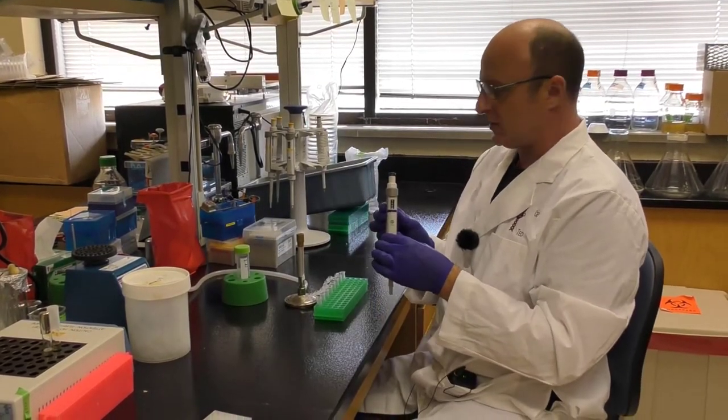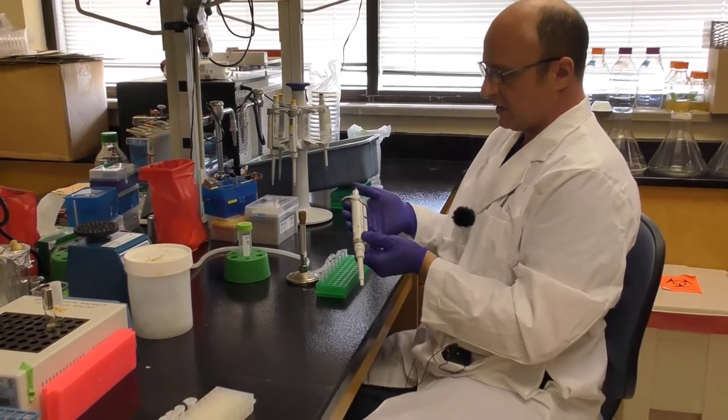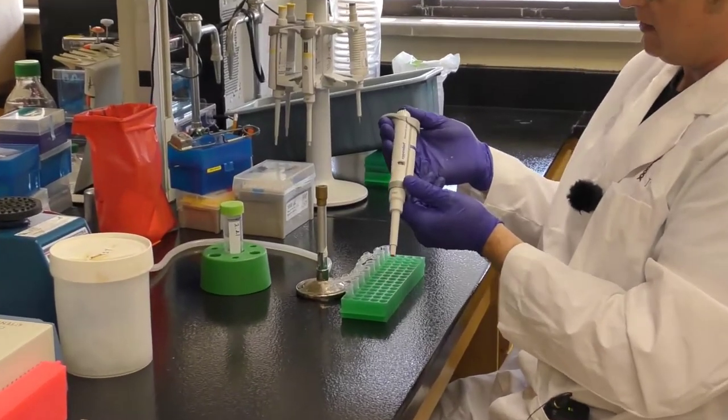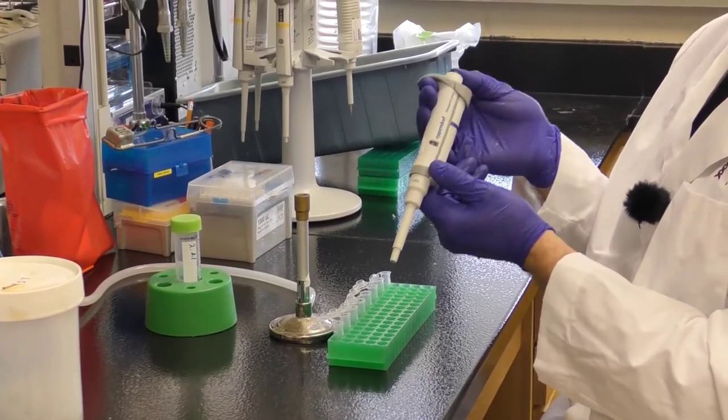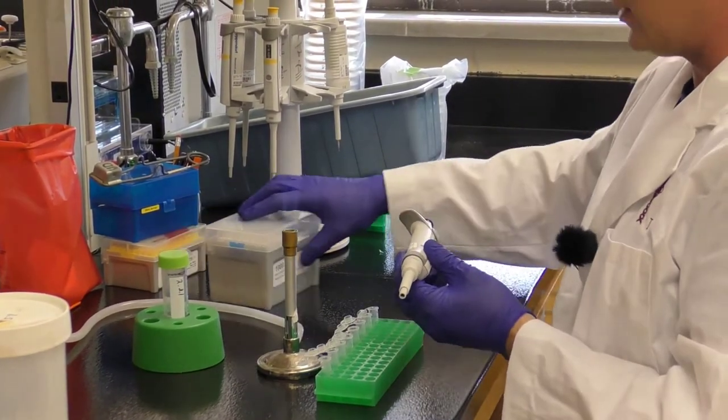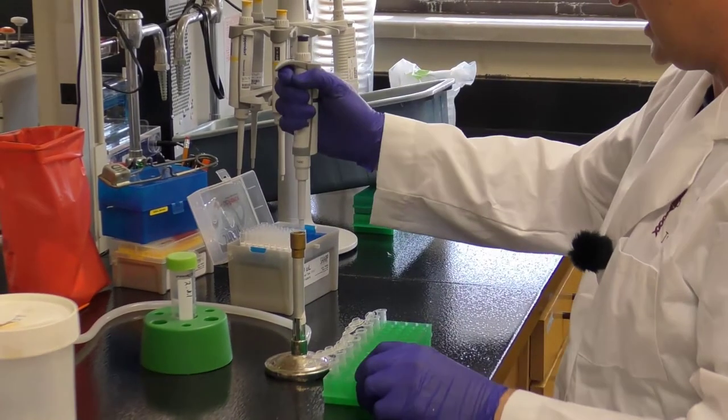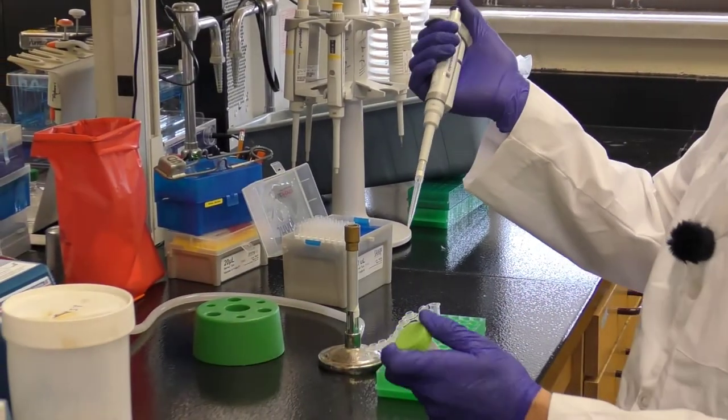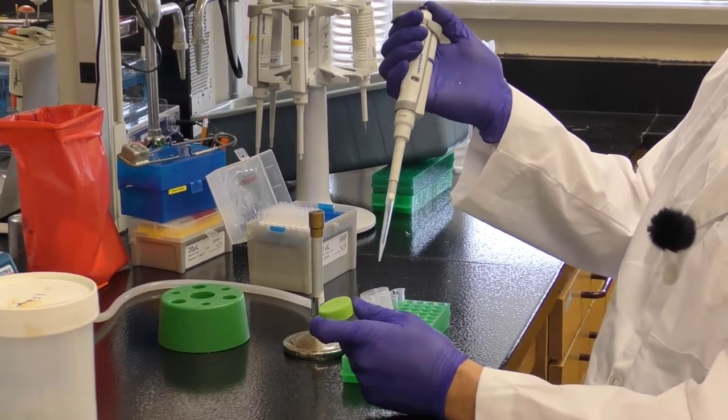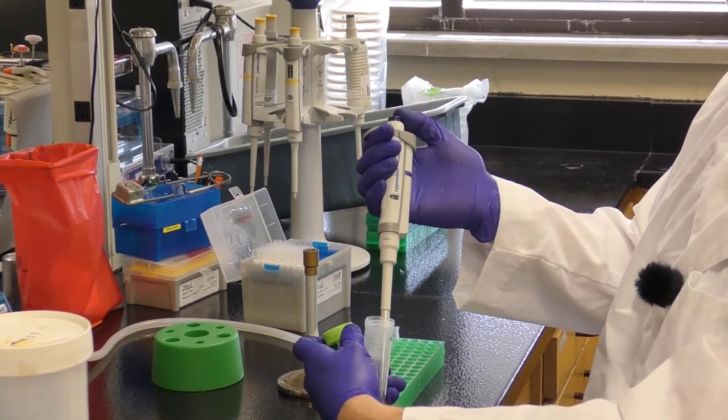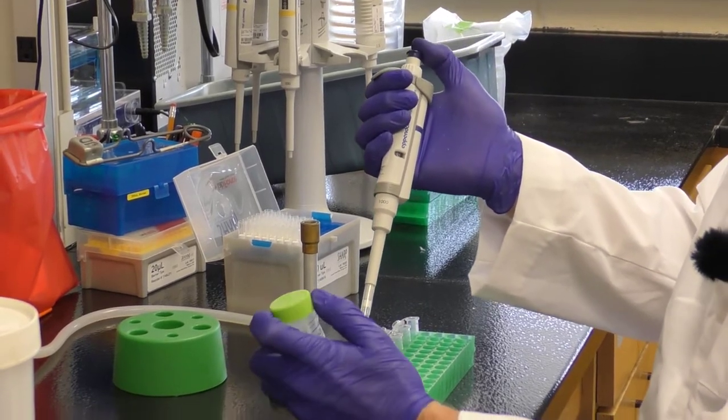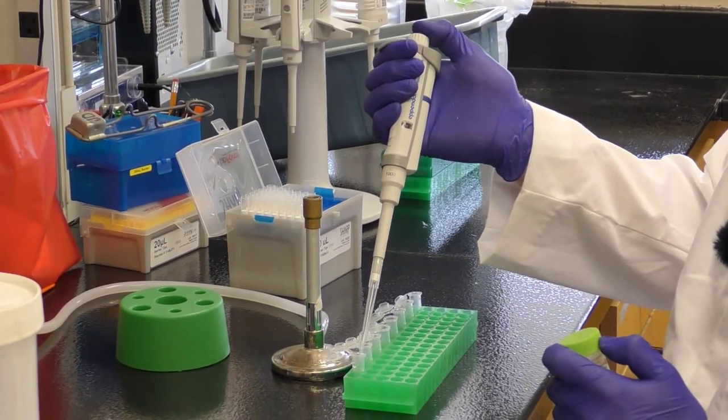My pipette is set to 900 microliters and as always we make sure that we know that the first shoulder we hit, that's the actual volume that we require, and then if we push through that, that's to eject the complete amount of material. I will show you two different techniques for doing this process. The first is standard pipetting. We push the plunger down to that first stop, stick the tip just into the top of the liquid, bring up our 900 microliters, pump it into the tube and then push through to that bottom shoulder.